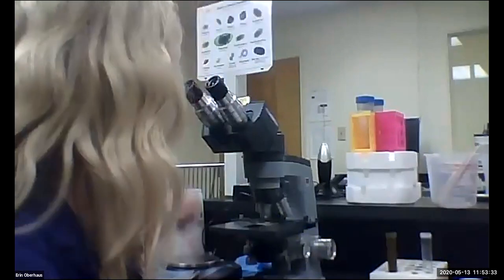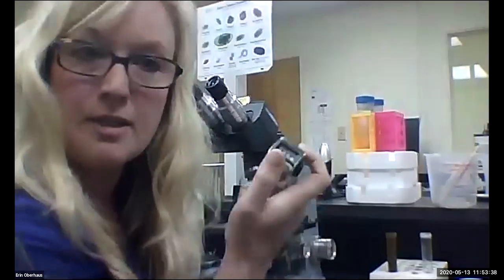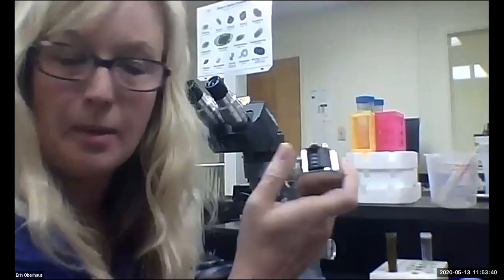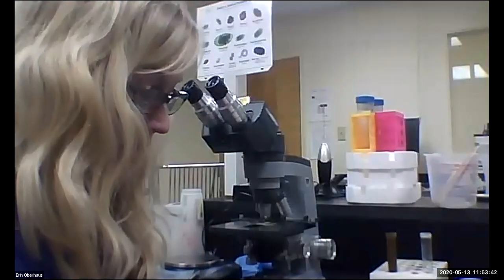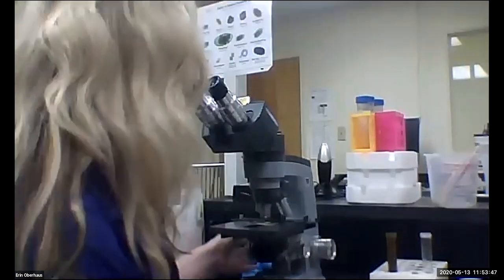If you want to use something to tally, like keep notes next to you, you can purchase a handy dandy clicker, so that every time you come across an egg, you click and you don't have to pay attention to both writing and looking.